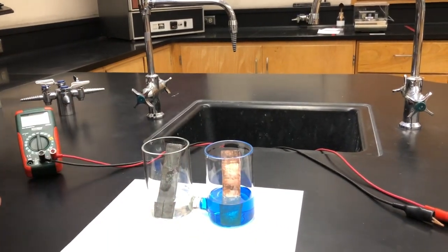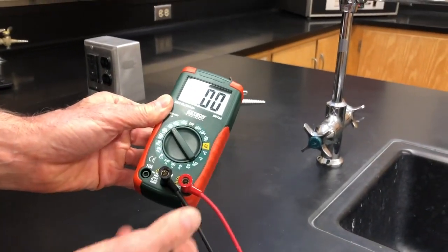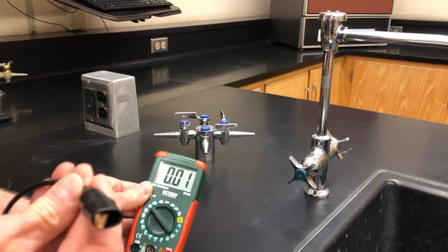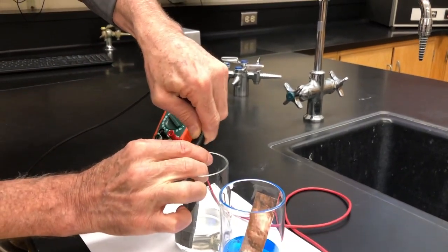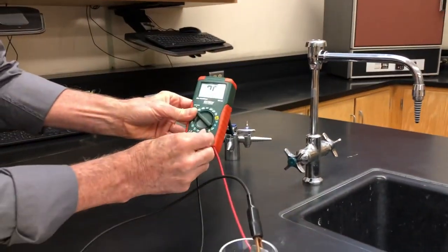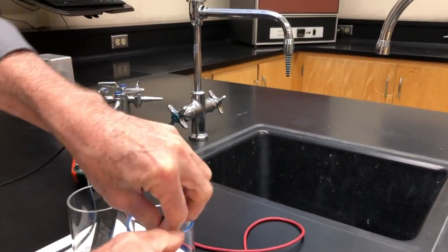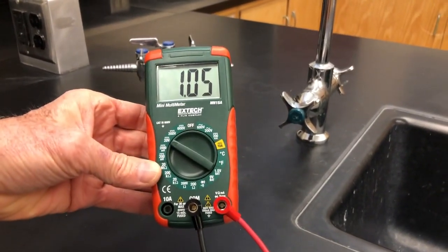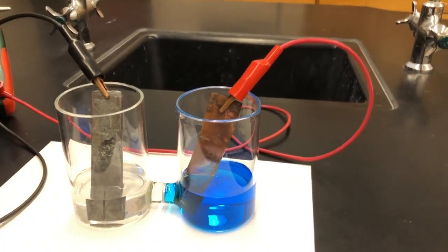In this case, we're simply going to measure voltage. So let's turn on our voltmeter. We have a common represented by the black wire and we're going to put that on the piece of zinc metal. Then we have a sensing electrode represented by the red wire and we're going to connect that to a piece of copper metal. And you may notice we get a voltage of about 1.05 volts — that is the potential of this electrochemical cell.